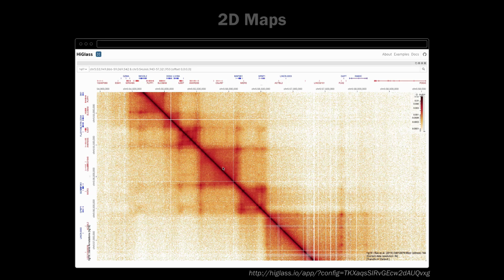As I said earlier, we care about chromosomes, TADs, and loops. So these darker spots in the corners here are loops. So there's basically interaction between these two points. That is a loop. Then these larger blocks that we see are TADs, topologically associated domains, that we're interested in. And we've already zoomed in too far to see an actual chromosome.